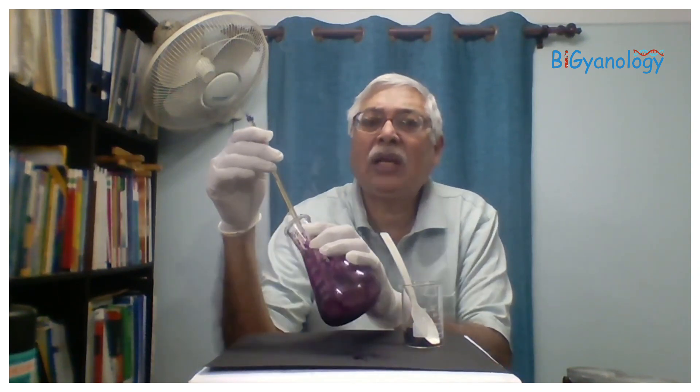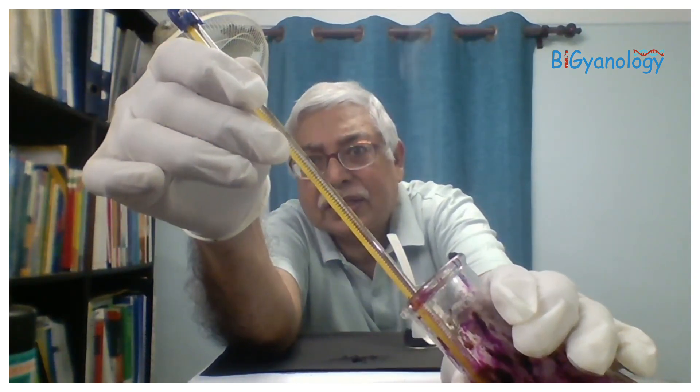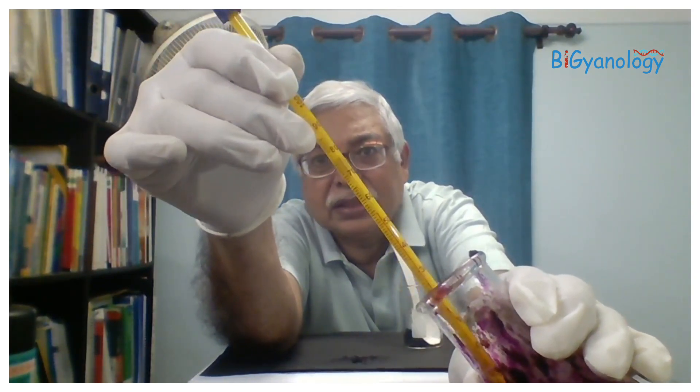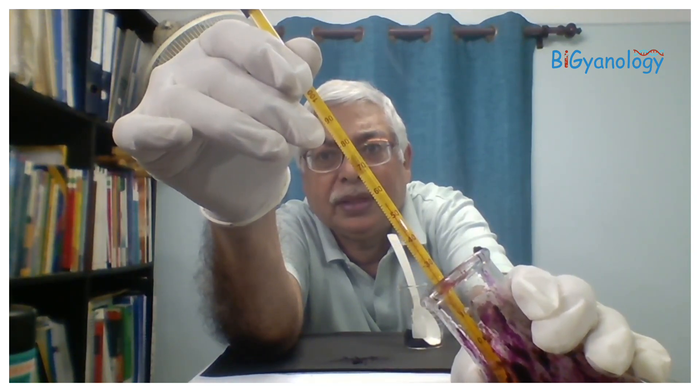The temperature increased a lot. I am checking with the thermometer — temperature is about 55 to 60 degrees Celsius. The temperature has become quite high, and now it's reducing every minute.